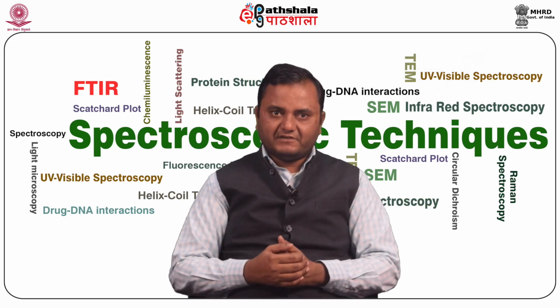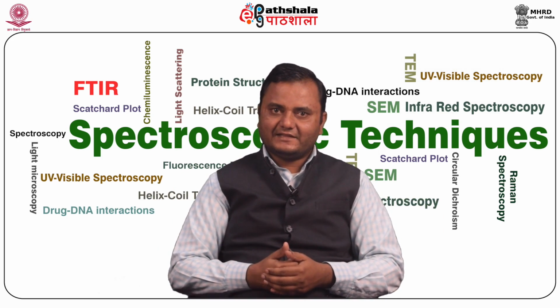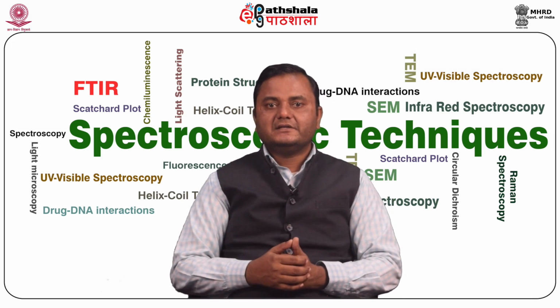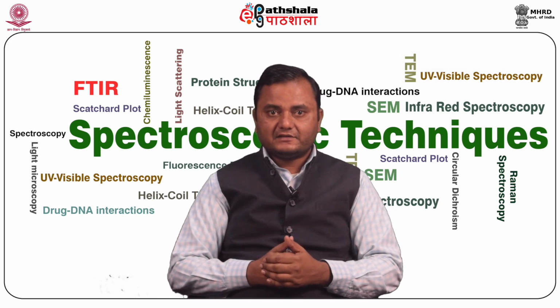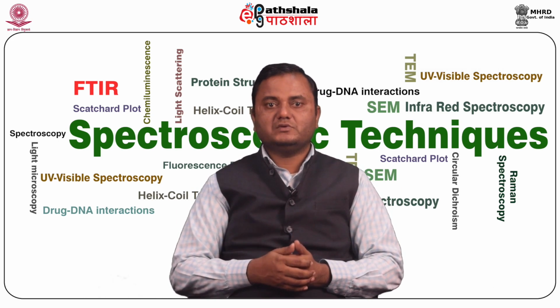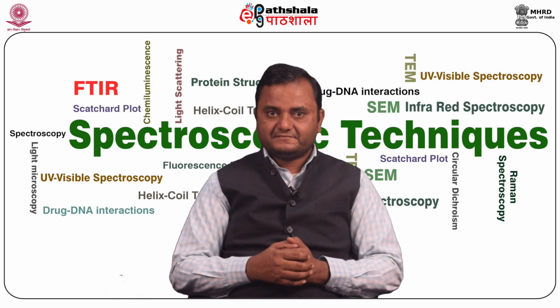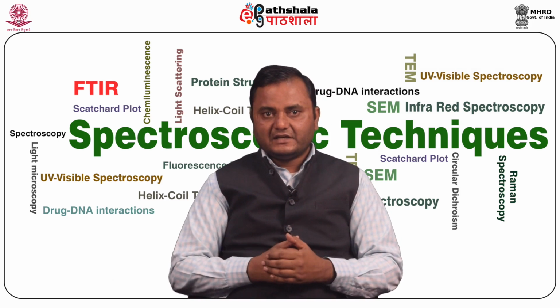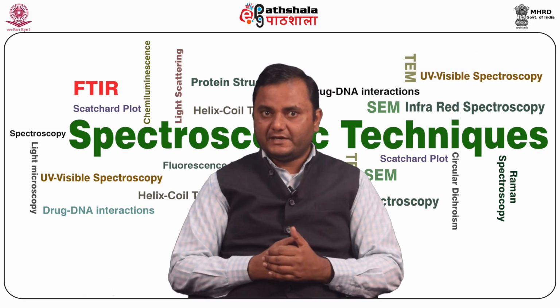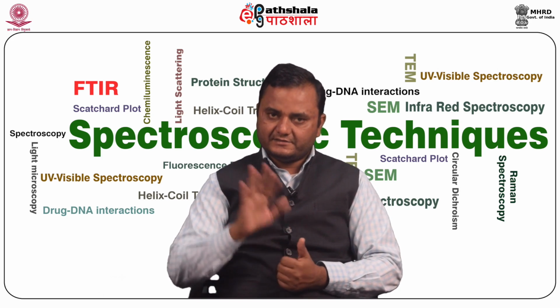Apart from all these advantages, FTIR also has some disadvantages, like the single beam. It requires collecting a blank. It cannot use a thermal detector because thermal detection is too slow a process. CO2 and water are highly sensitive. It is also too sensitive, so it would detect small contaminants. These are some disadvantages associated with the IR.